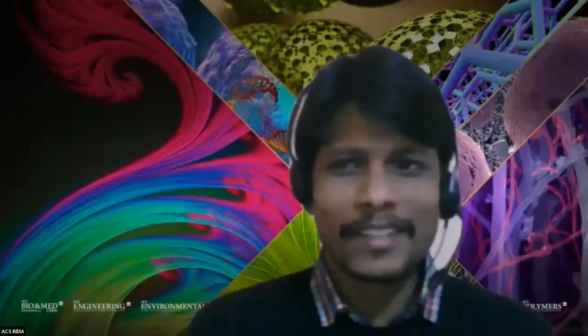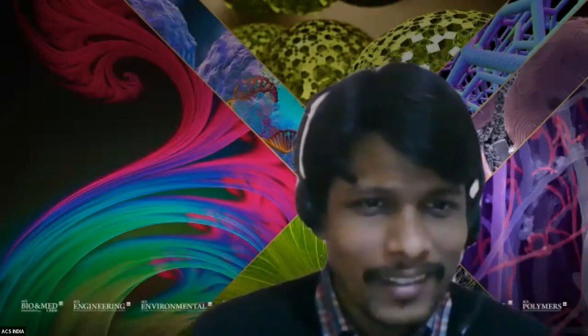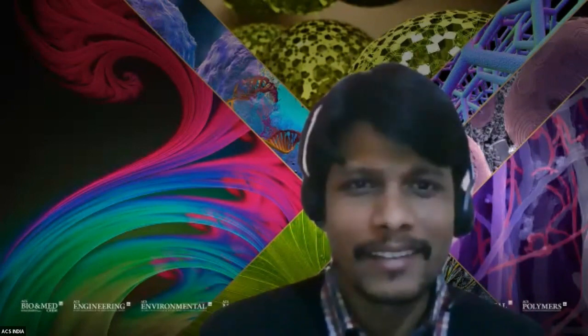In the constraint of time, we'll take the last question, Professor Umapathy. I'll take this one. Can we identify 3D structures of blood cells in vivo using this technique? Yes, we can. And this is something we have already demonstrated in the lab. Right now, we are working on trying to identify diseases based on this non-invasive in vivo detection of blood, and we are working on it.